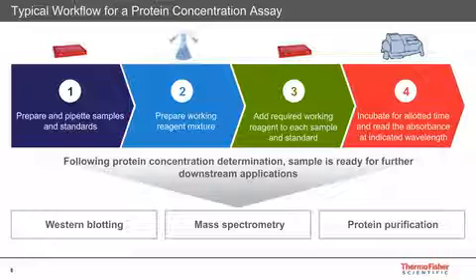You have to keep in mind that if the sample is diluted, then the final concentration of the sample is determined by the concentration obtained from the graph times the dilution factor.